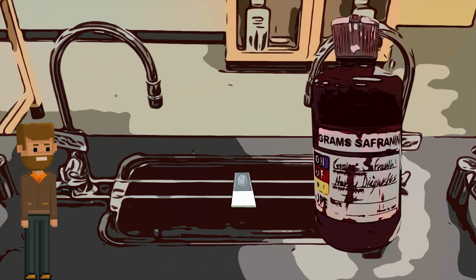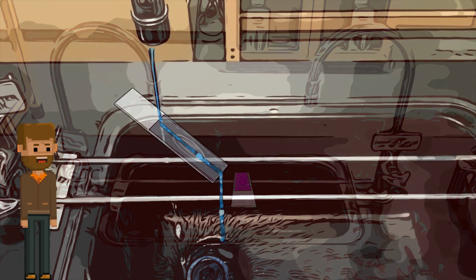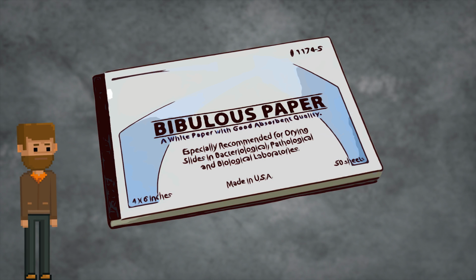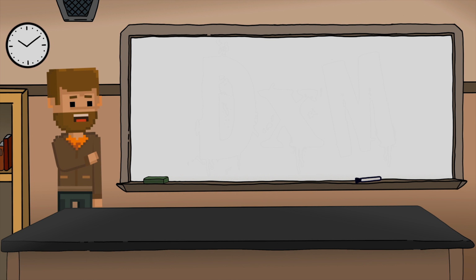After you're done decolorizing, place the slides back on the staining rack one more time to flood it with Gram's safranin. Leave the stain on the slide for another minute, and then rinse with tap water and blot dry it with bibulous paper. Now you're ready to observe the slides under the microscope.